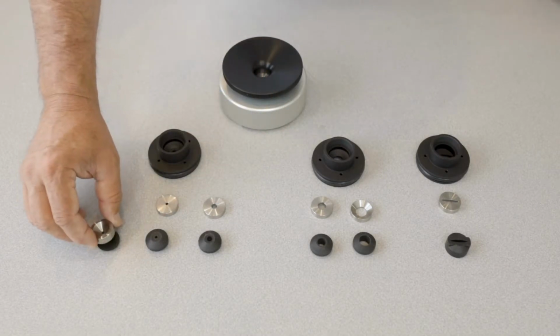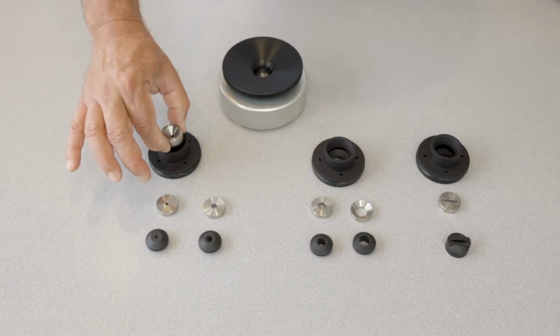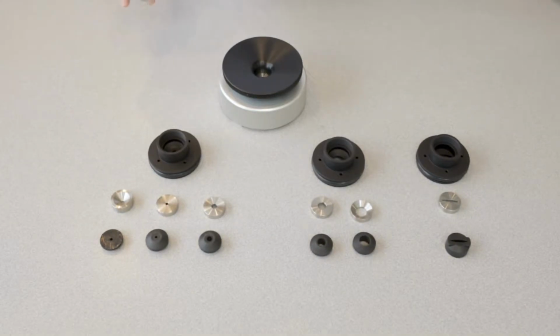So we just stack the gasket and the insert like that, and that drops down in the 1/4 inch sealing system. That one has the name almond sealing system, but it's mainly the fact that it's a short petiole. For very short petioles, it'll work well. They can't be larger diameter than 1/8 of an inch, but it's a great option for that.